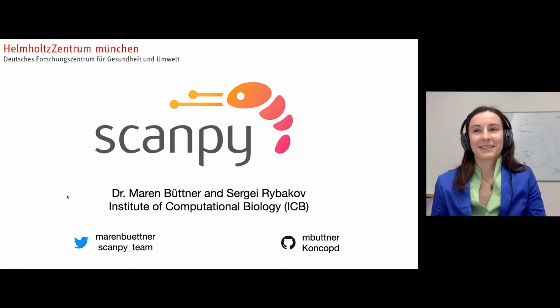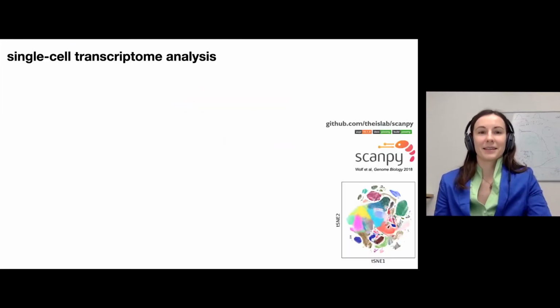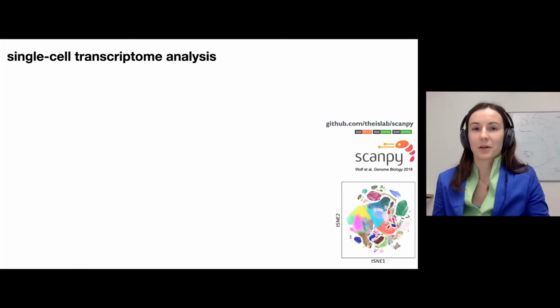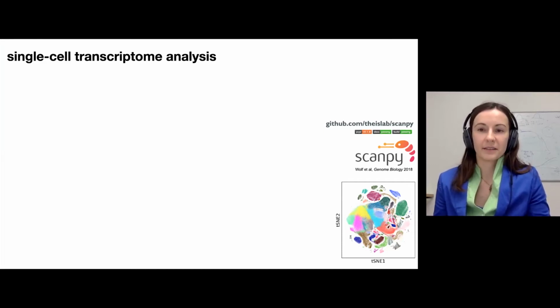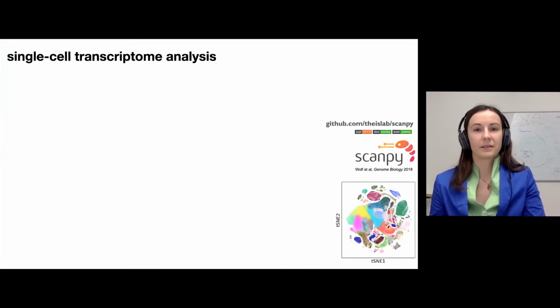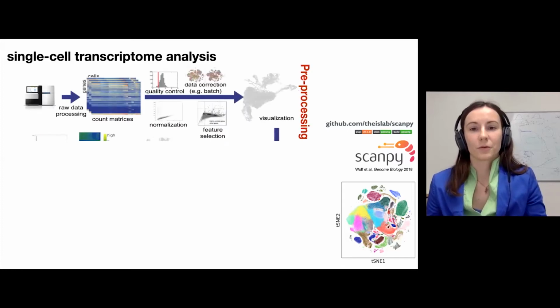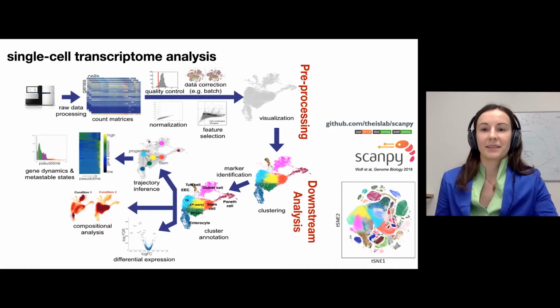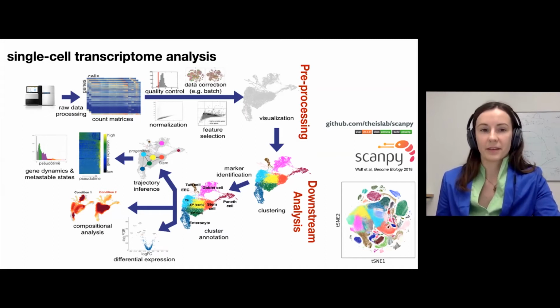So Scanpy is the single cell analysis platform in Python. We work entirely in Python, and it was originally developed predominantly for transcriptomic analysis. When we think of single cell transcriptomic analysis, RNA sequencing data, we have thousands of cells and thousands of features, and we have to walk through lots of steps in a pipeline to make sense of the data and recover patterns. Luckily, you can do all of these steps in Scanpy.